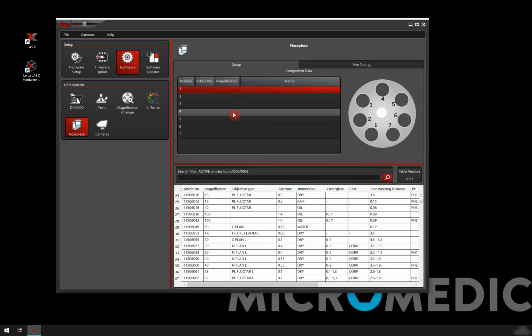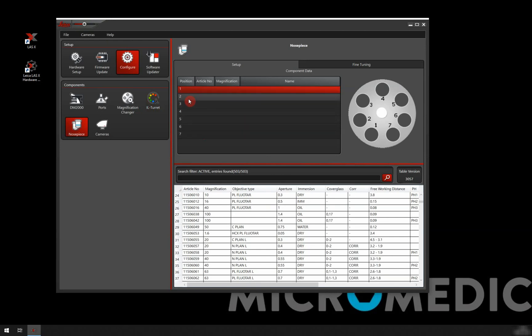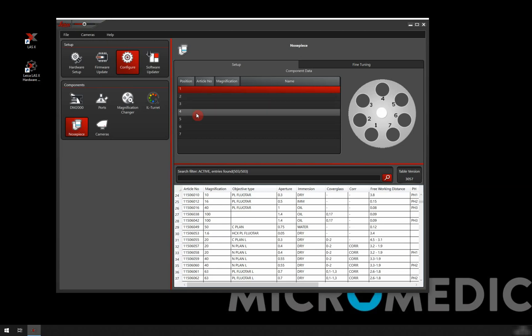But in the hardware configurator, it always shows up with seven. But you basically just add the objectives that you have in here. The rest will be empty.